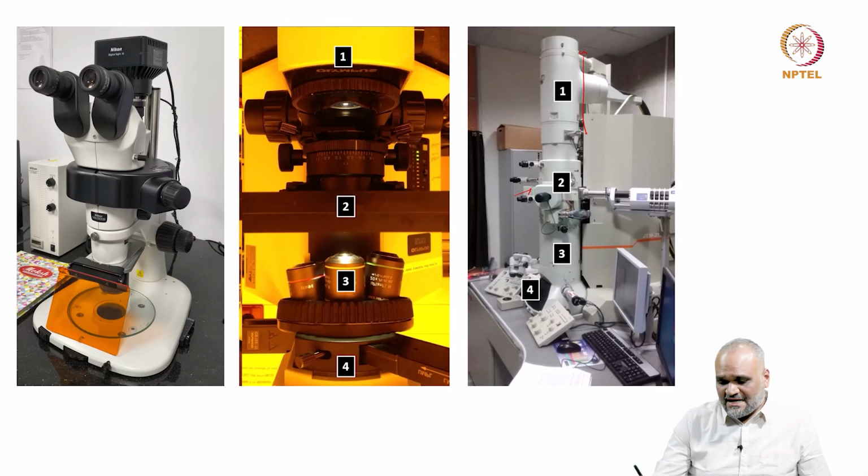And then you start imaging, and if there are any aberrations, you start correcting for the aberrations in the imaging system, and then you start visualizing the data. Here in this particular thing, you have a fluorescent screen here. There's always a confusion when I'm teaching a course.